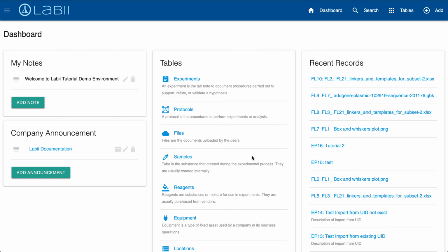Another tutorial video for Labii ELN and LIMS. For today's video, I'm going to walk you through how you can manage projects and how you can manage individuals and teams within a project.